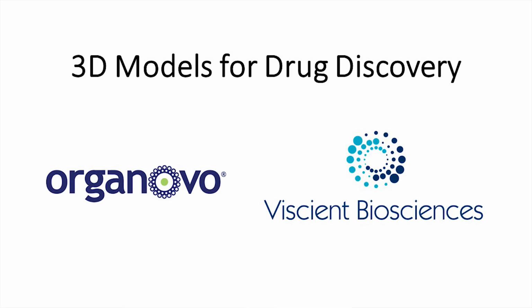I'm going to talk about a little bit of a different perspective, an industrial perspective, and I'll go a little bit into detail on Organovo's technology, but also speak about the industry in terms of the pharma industry viewpoint on opportunities for these 3D models in drug discovery.